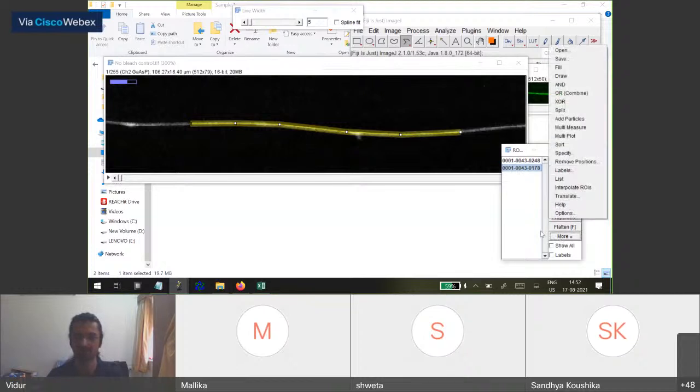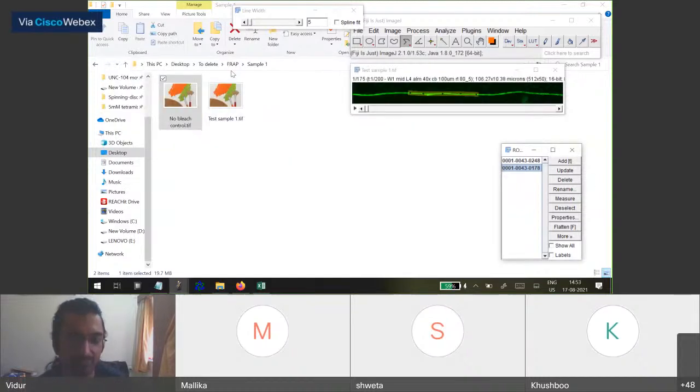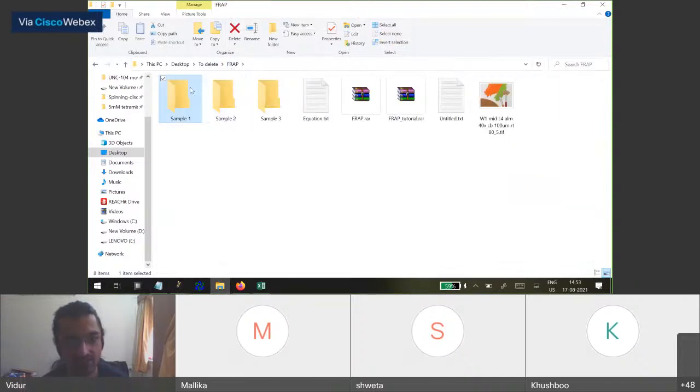Hello, and you can always... Yes. Khushbu has a question. Oh, yes, Khushbu, you can unmute and ask. Vidur, I'm not able to find which file. I think I'm confused. Oh, okay. You downloaded the zip file, right? Yes. The one named for imaging workshop, right? No, this is the FRAP underscore tutorial. Oh, yes. You've opened that?